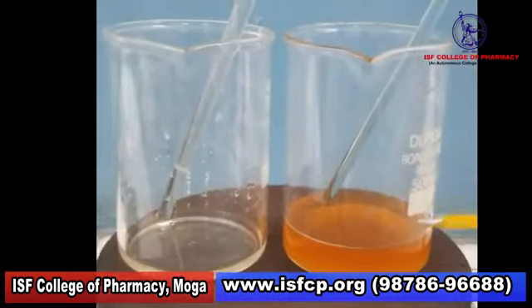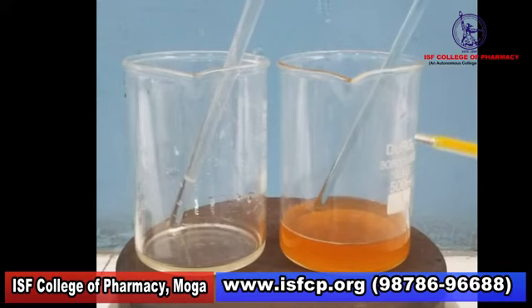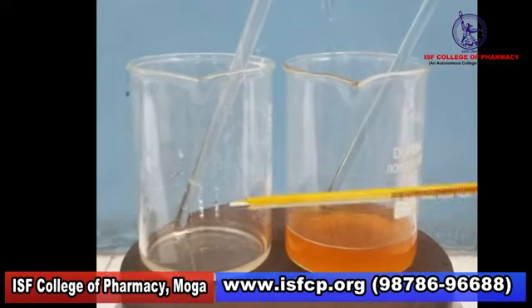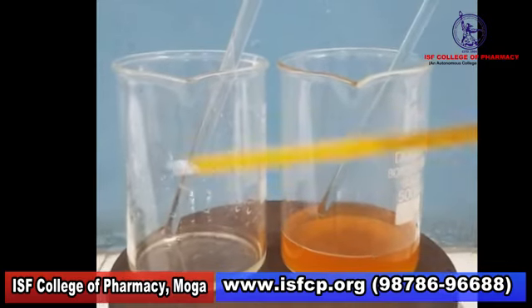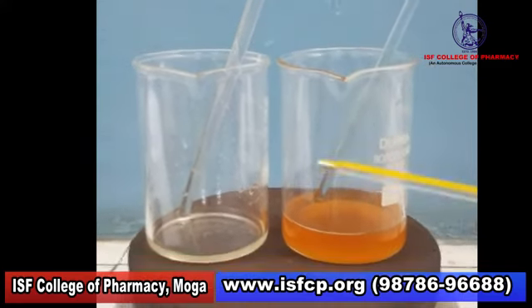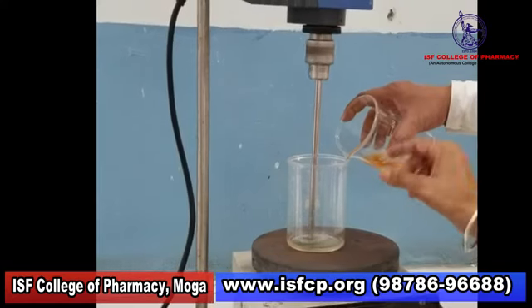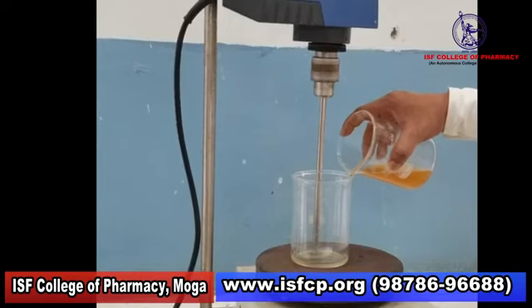Now the two phases, the aqueous phase and the oily phase, are ready. The temperature of both phases is kept at 70 degrees centigrade. The next step is to add the aqueous phase to the oily phase. Firstly, we keep the oily phase under the mechanical stirrer at a speed of 300 to 350 rpm. The oil phase is kept on the hot plate, the temperature inside the beaker is maintained at 70 degrees, and we add the aqueous phase slowly to the oily phase.